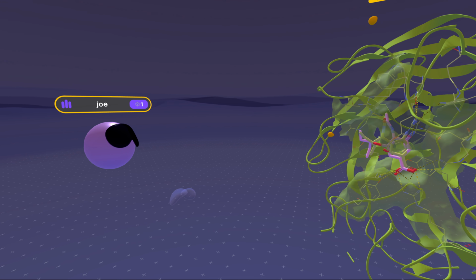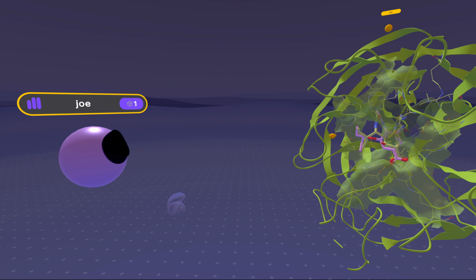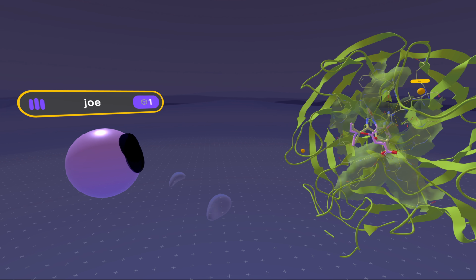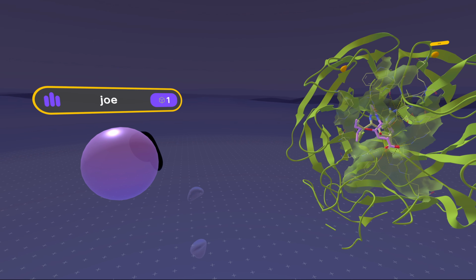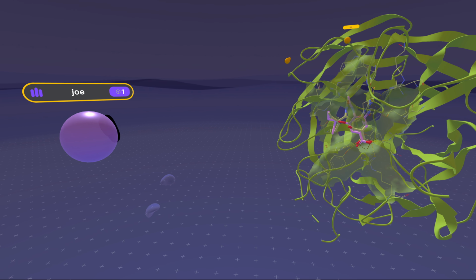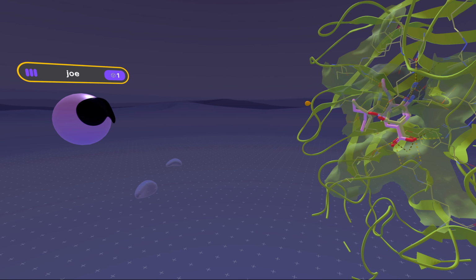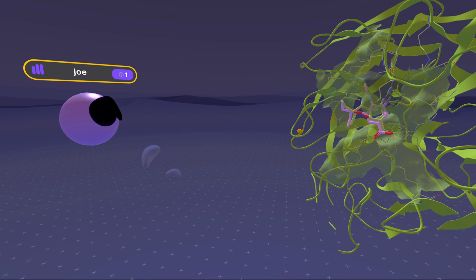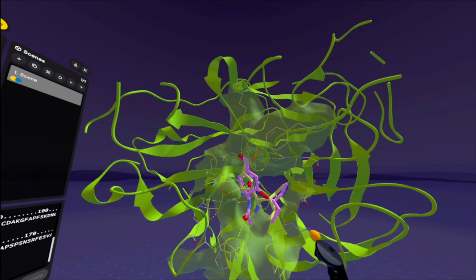The spirit of our model playback is to be able to show multiple models in a series of frames. It's not a true trajectory playback. So we do have big plans for molecular dynamics. So yeah, the model playback is really just to give users the ability to show multiple frames in a series, like an animation, but not full-on molecular dynamics trajectory.